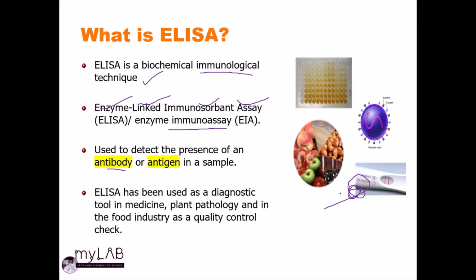It's being used in diagnostic kits. It is being used in the traditional ELISA test system. Of course, today we also have kits that have simplified the process, and we are also using it in the food industry, plant pathology, among many other areas, even in biotechnology.